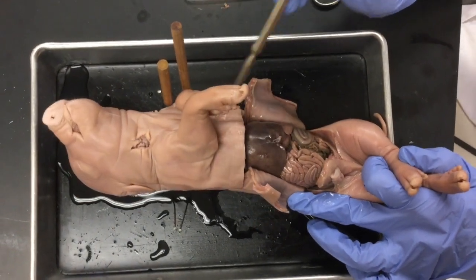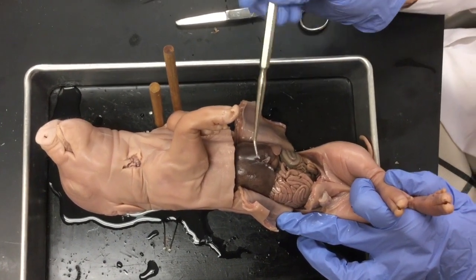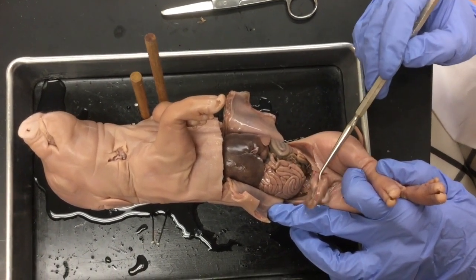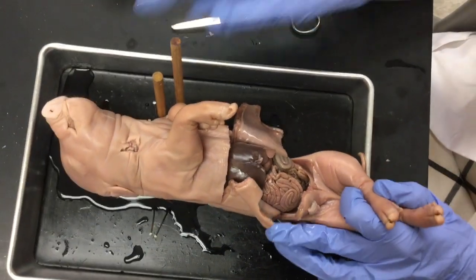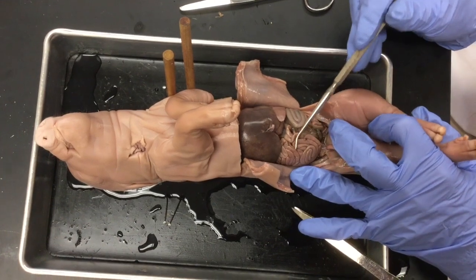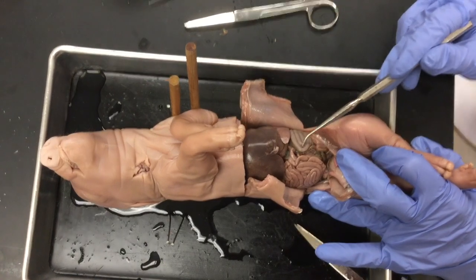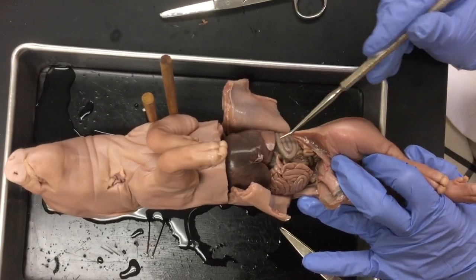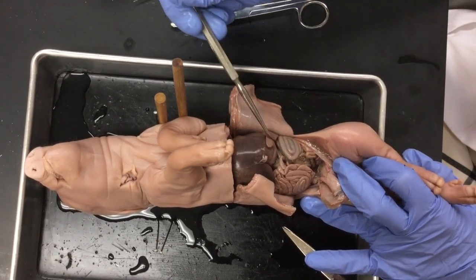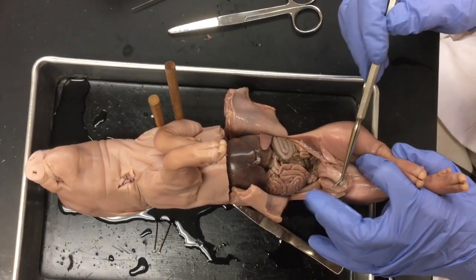Notice how far down your cut should be when you're actually cutting into the abdominal cavity. We can see where the vein was, attaching to the umbilical cord. We have several structures visible right away: intestines — small and large intestine — a greenish curlicue structure, a flap, some connective tissue. We can also lift the liver up and take a look at structures underneath.